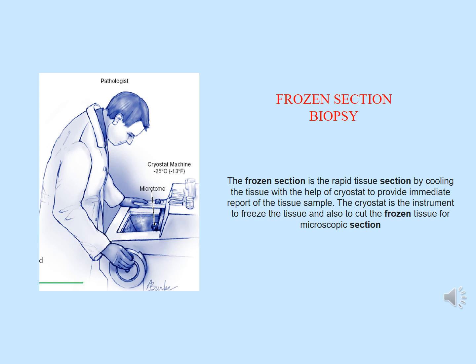That's the aim. Frozen sections are indicated for intraoperative diagnosis. This setup is usually placed right next to the operation theater, where our surgeon colleagues are doing a particular surgical procedure, and they need to know the diagnosis while they are doing the procedure so that it can direct their surgical treatment. That is where we do it. So that's why we call it intraoperative diagnosis.